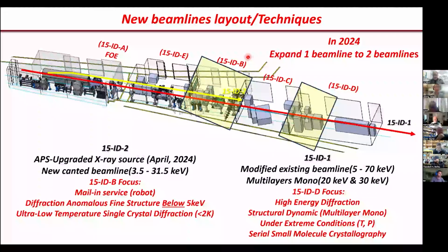By the way, all the detectors that you have are cadmium telluride detectors, correct? You're not using any silicon? We have a silicon one for the ID2 line. That's what we use at Cameron. The rest we will probably keep as cadmium telluride in the ID line.